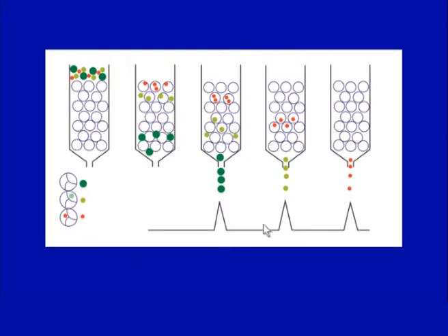The next one, you can see how the peak resolution can take place if their molecular sizes are far apart, and they could be easily separated into different fractions and could be utilized for different applications as a purified product.